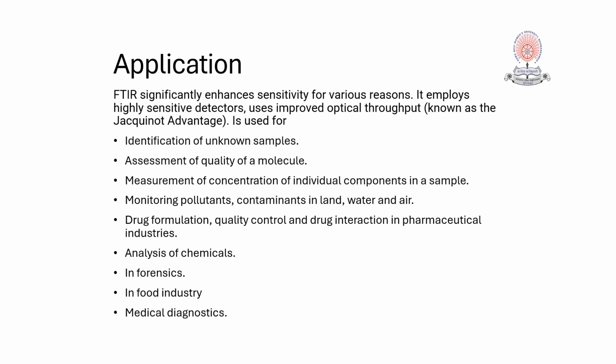It uses improved optical throughput, and it can be used for the identification of unknown samples, assessment of quality of a molecule, then to measure the concentration, that is for quantitative analysis, qualitative analysis, monitoring of the pollutants, formulation of the drugs, quality control of the drugs, and to study the interaction of drugs in pharmaceutical industries, to analyze the chemicals in forensics, in food industry, in medical diagnostics, and several more applications.